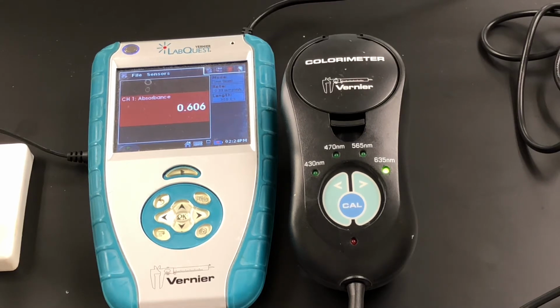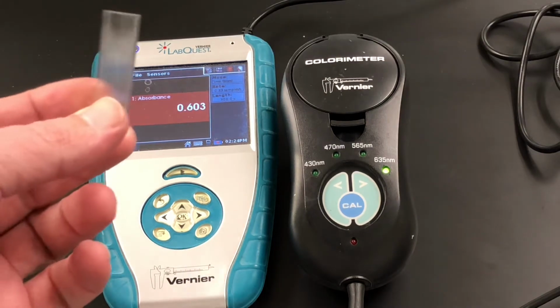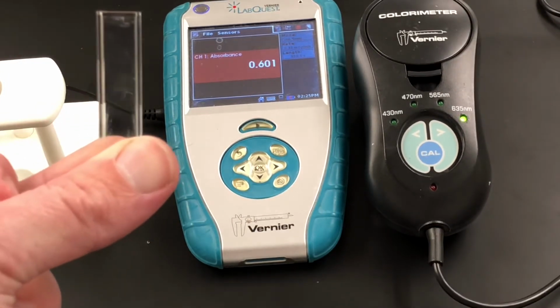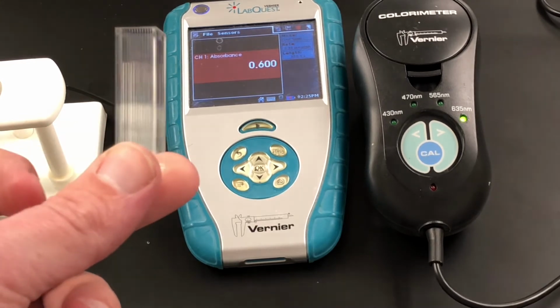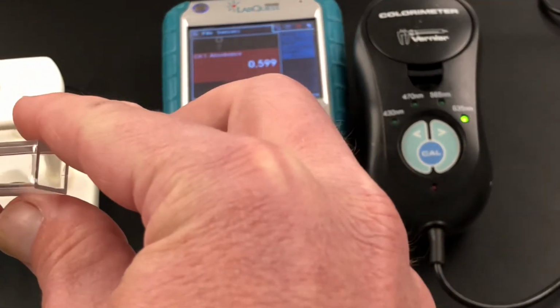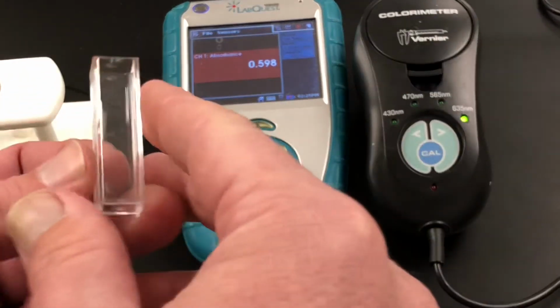Now, one of the first things that we have to do is get what's known as a cuvette. We have to have something to put our sample into. When we look through the cuvette this way, it's crystal clear, and when we look through it this way, it's kind of foggy. The light's going to pass through the super clear sides, so you want to make sure there aren't any fingerprints or anything on there.